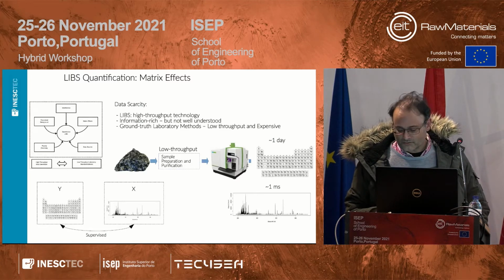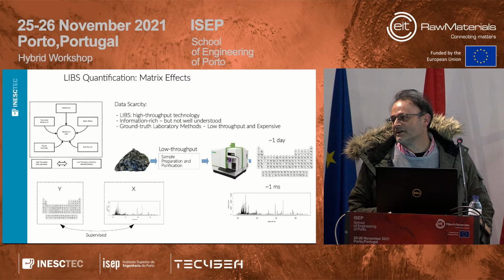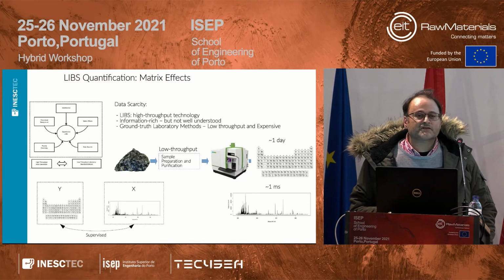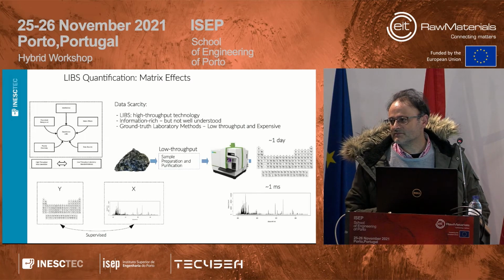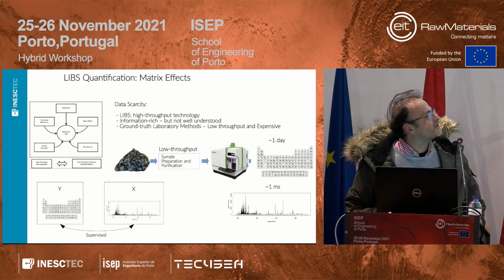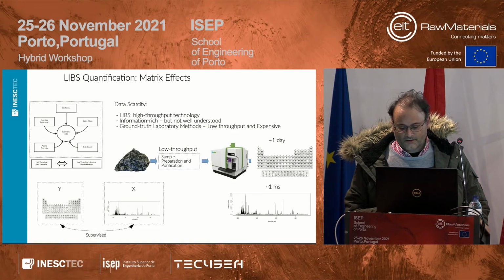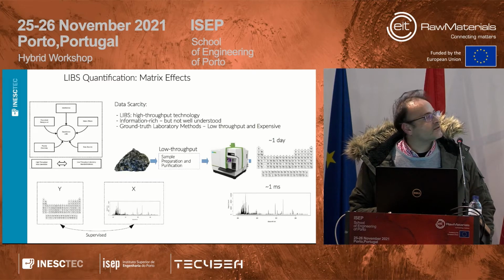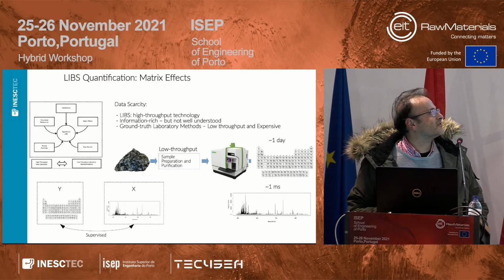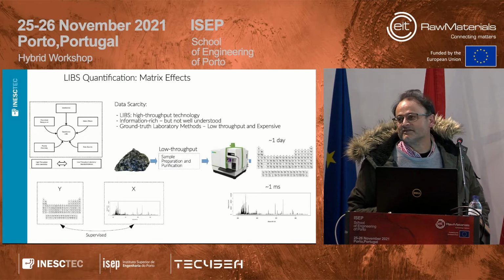And we are trying to address this issue by developing methods that can augment the data. Of course, these methods are not equal to image augmentation, as many algorithms exist for deep learning, because we need to respect the proportionality between the LIBS signal and the concentrations. But this is one of the big problems because ICP-MS, for instance, which is a ground truth method, is a very expensive method.